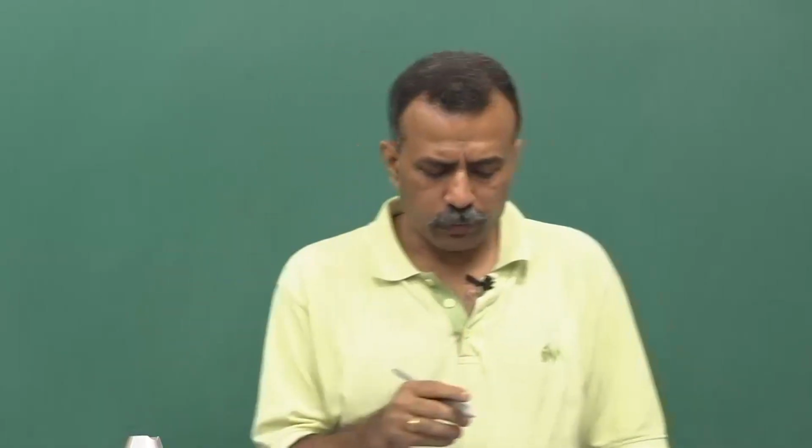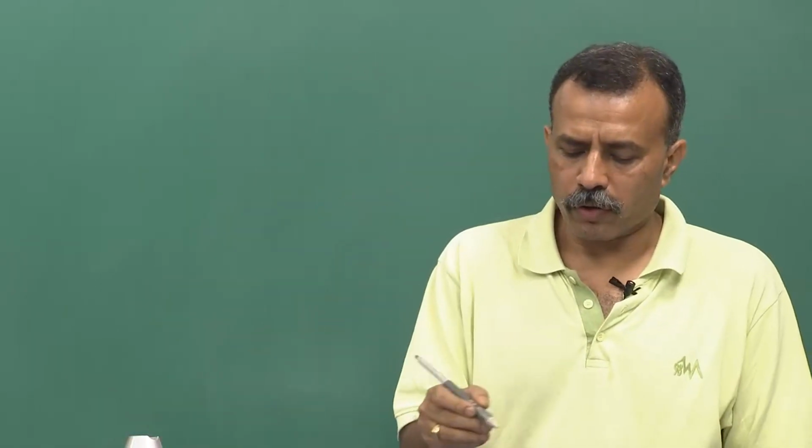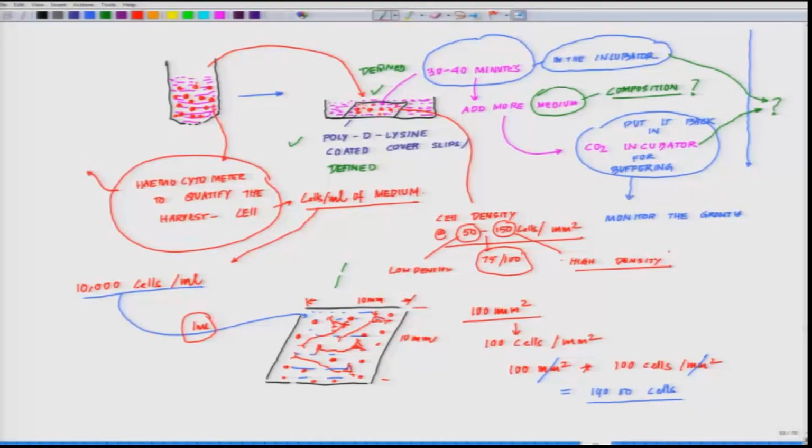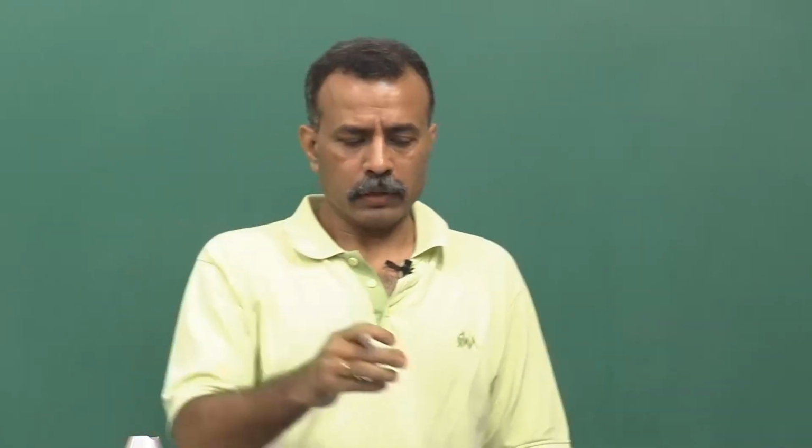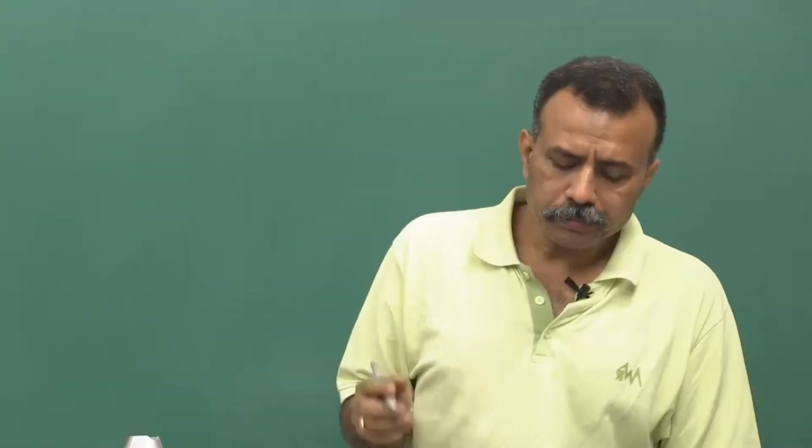Okay. So, now once I have told you about this hemocytometer calculation, you can really pull out any manual where they do the blood analysis, and figure out how much you have to put and how many cells you are seeing.